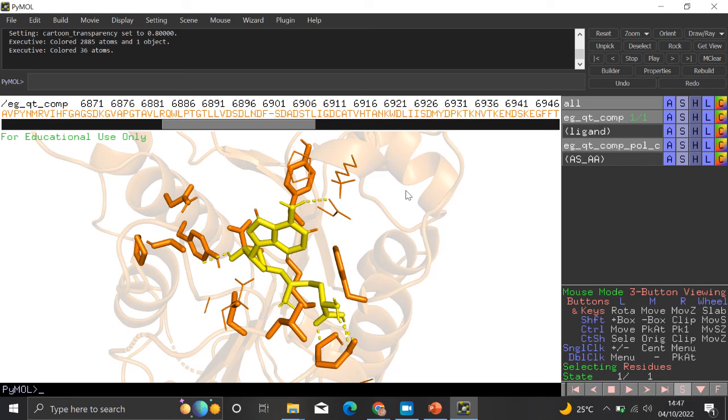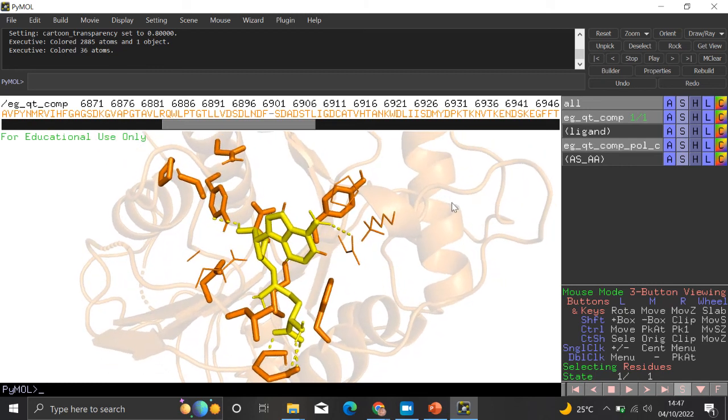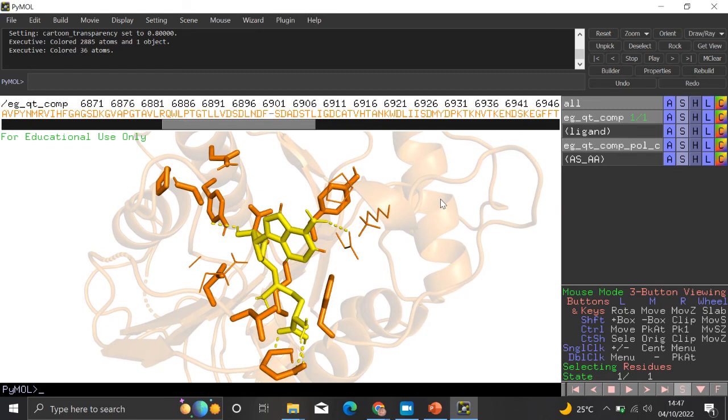Like if you want to visualize 5 proteins for your manuscript, it's not a good practice to have different orientation for the five proteins. So we can just look for an orientation that perfectly shows everything that is happening in the active site, and we maintain that orientation for every other visualization that we are going to do. So now we will be leaving it in this orientation.